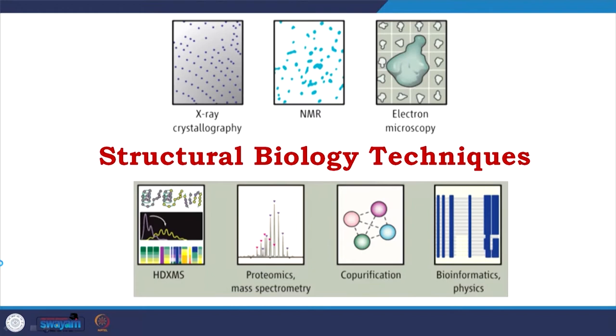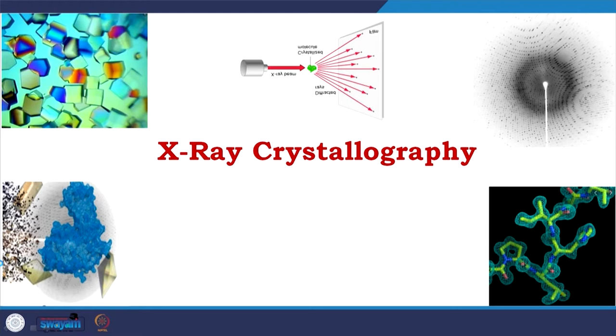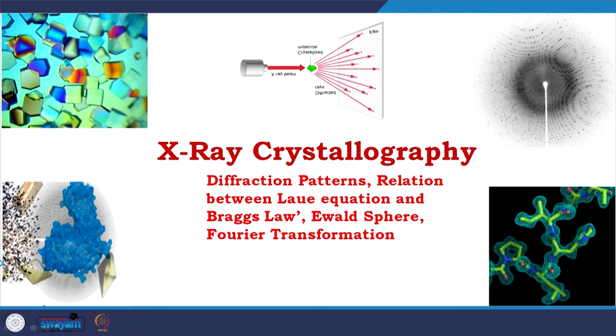We are discussing structural biology techniques, and today we are starting on the fifth module, where we are going to continue with X-ray crystallography. Today we are going to discuss diffraction patterns and the relation between the Laue equation and Bragg's law.